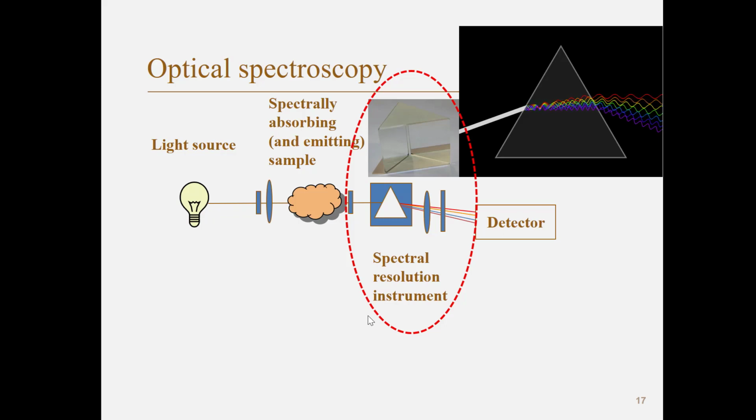But while we talk about them, we will also go back and discuss some light sources which are also useful for spectroscopy. We'll talk about that at the same time as we discuss spectral resolution instruments.